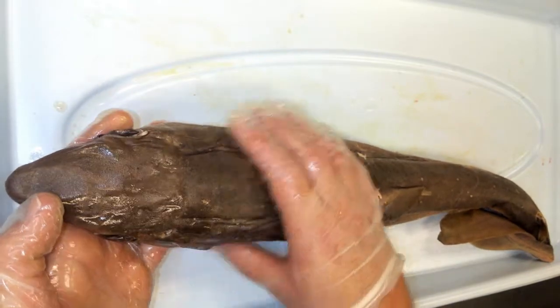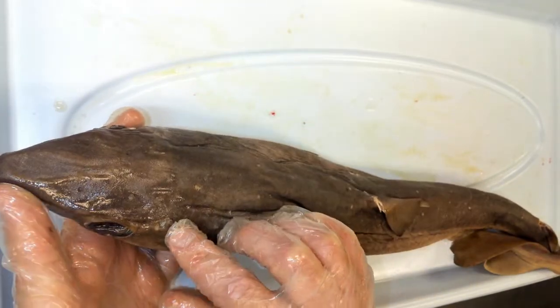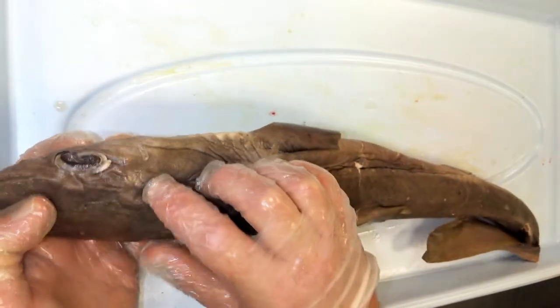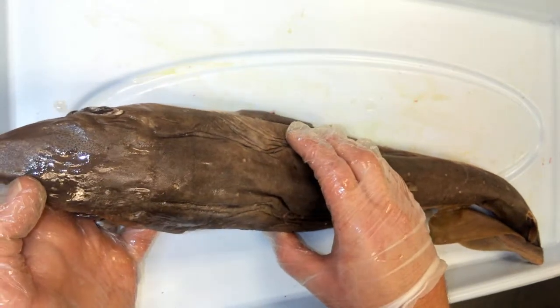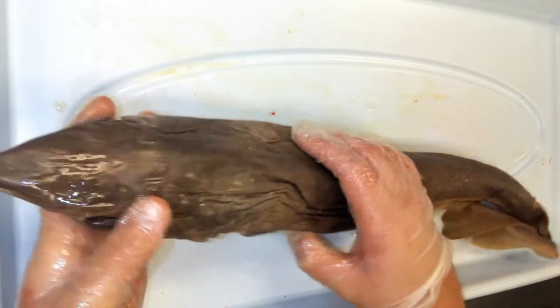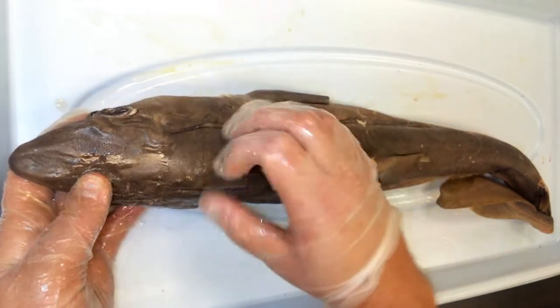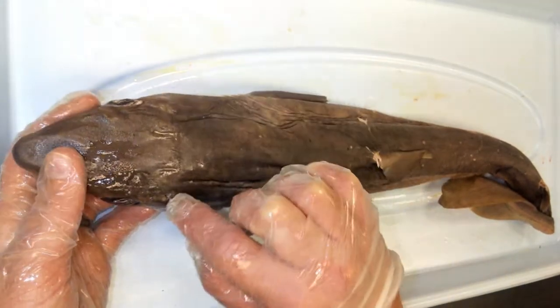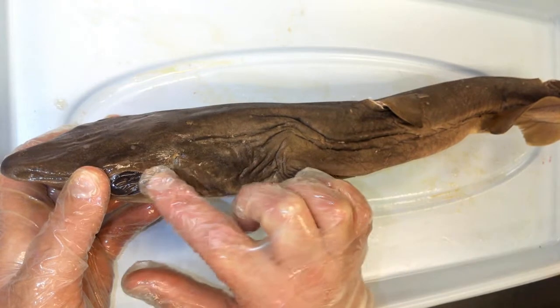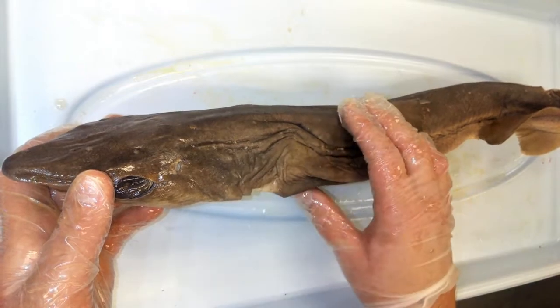A structure that helps with respiration — more cranial, more anterior on the dorsal side — are these two openings called spiracles. What the spiracles do is aid in respiration: when the shark is at rest on the ocean floor, these spiracles continue to pump water into its head so it can keep absorbing oxygen. It's basically another entry point for water so the gills can absorb oxygen from it.